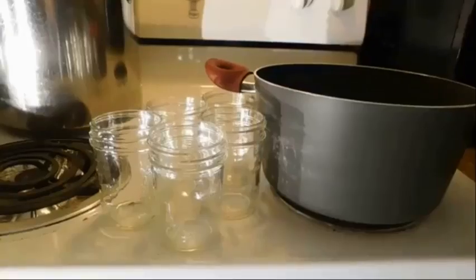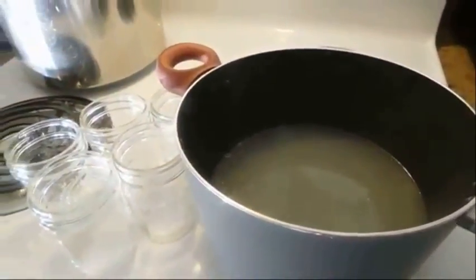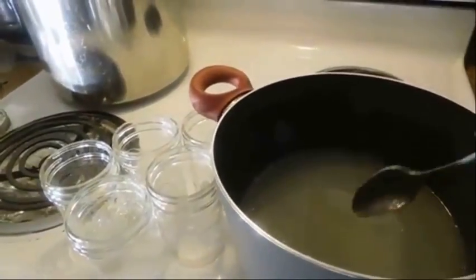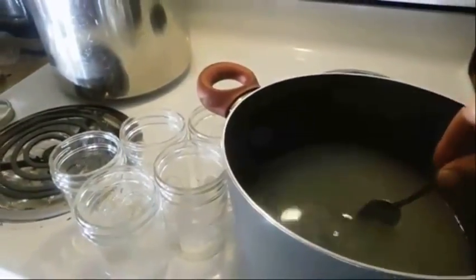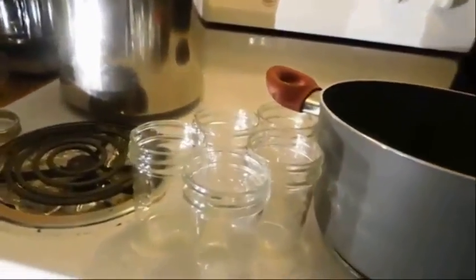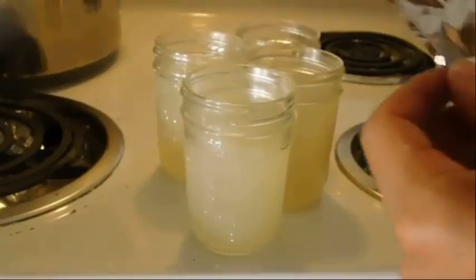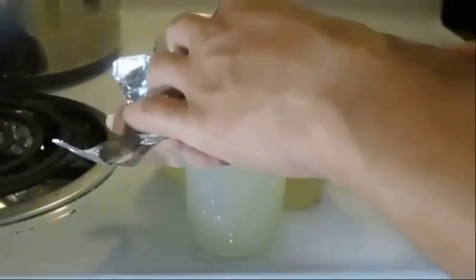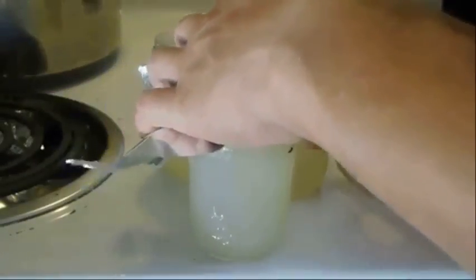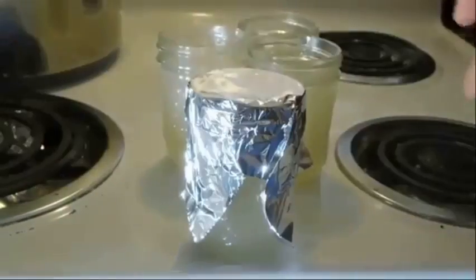Now that you've brought your agar to a simmer — just barely boiling — you can see how thick it is. Go ahead and pour it into your little mason jars. Now that the agar is in the jar, you're going to put tinfoil on top. Put a piece of tinfoil over the jar, wrap it around real nice, and grab the ring to secure it.